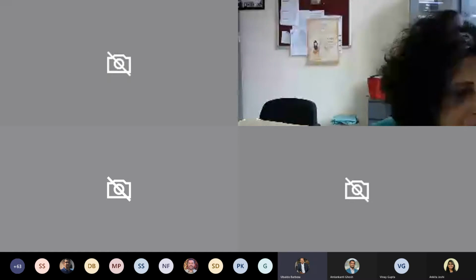Okay, so the participants can take part in the quiz and submit the answers. I think some have started responding. The first question, I believe, is: identify the true statement from the following. PhenoGraph requires number of clusters input from user. FlowSOM requires a number of clusters input from user. Both are correct. None of the above are correct.